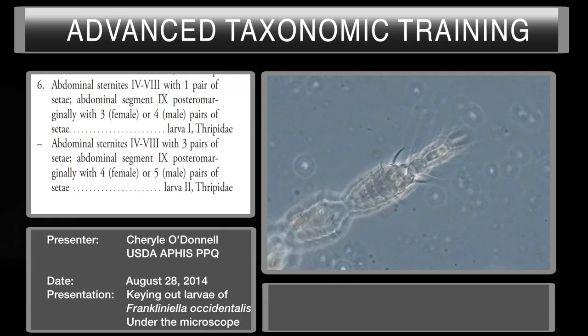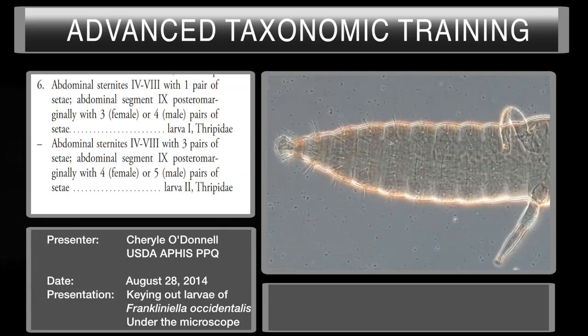Couplet number six asks about the abdominal sternites four through eight. Part A asks if the abdominal sternites four through eight have at least one pair of setae. We are looking at abdominal sternites one, two, three, four through eight. They have more than one pair — there's one, two, and it looks like there might be three. So our couplet asks if it has one pair; it has more than one pair, so we'll keep that in mind.